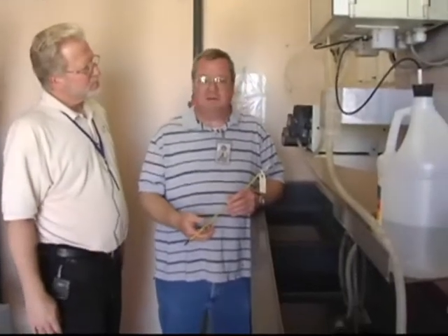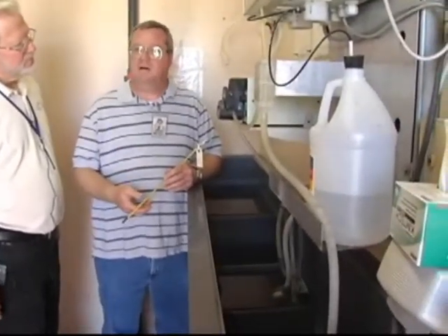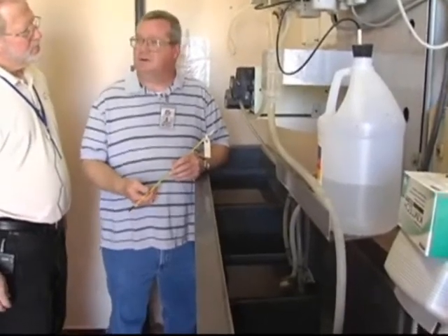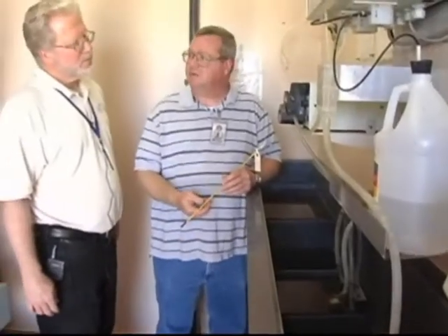This is an indoor environment, a little bit more controlled. This trough is representative of the outfall — one of the upland outfalls. They created it for easier sampling, quicker times for testing for chlorine. It's easier on the technicians to come to a trough with one of our samples.